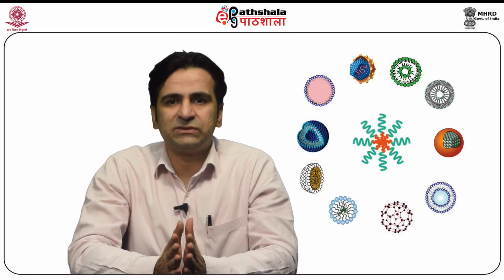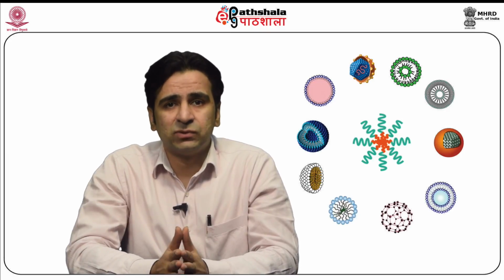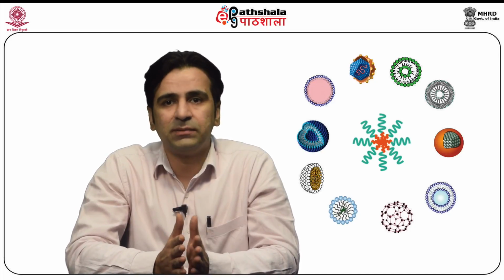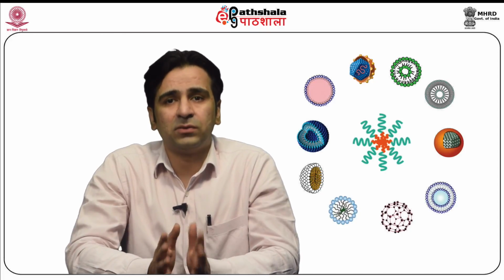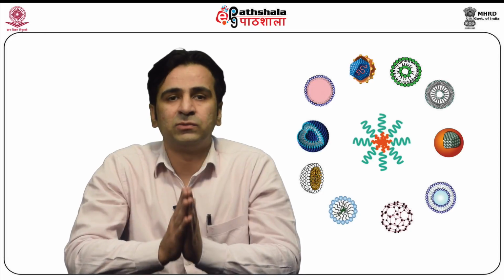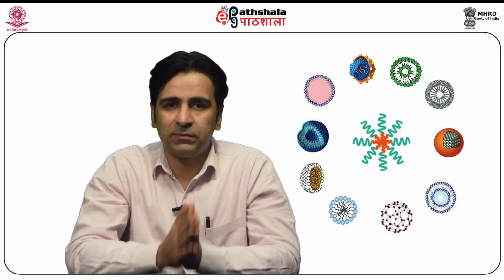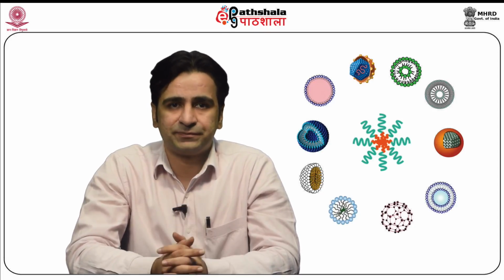Size of the liposome is one of the most important parameters because size of the liposome dictates its fate in vivo and also their mode and extent of action. It plays an important role when they are to be administered by inhalation or parenteral route. The most commonly used techniques for determination of size are, number one, electron microscopy, next, dynamic light scattering, and finally, field flow fractionation.